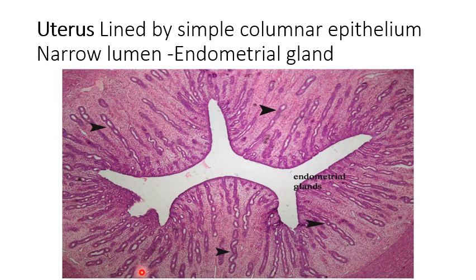The uterus is one of the large round structures with lumen. First, the lumen is so narrow, lined with a single layer of epithelium, which is simple columnar partially ciliated. In the mucosa, or the endometrium, these are the endometrial glands. In the muscle layer, we have the middle layer called stratum vasculare, containing blood vessels. You cannot see the stratum vasculare here.